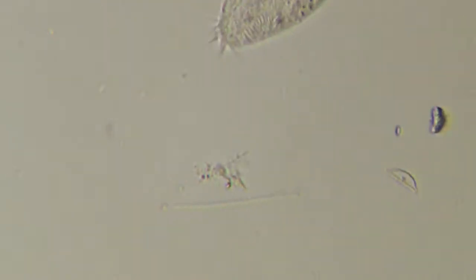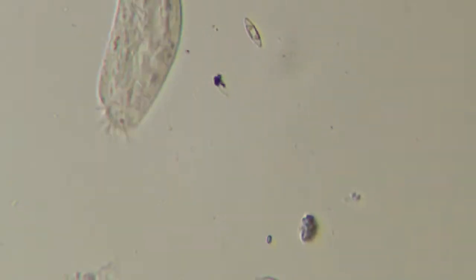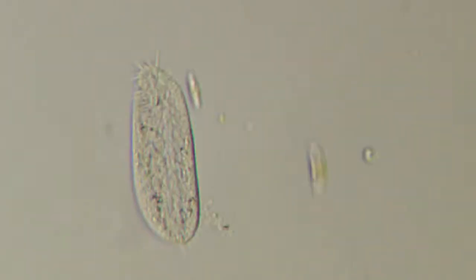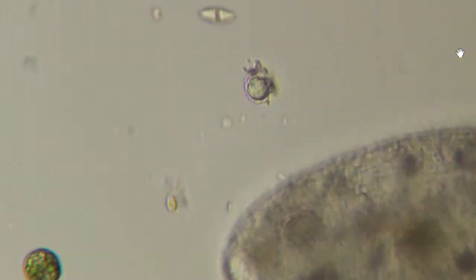XY stage is a little stiff for these fine details. It takes some extra finesse to get a smooth XY motion at a high magnification. And I'm going to zoom out digitally. I think I'm turning too much. And I can kind of follow. Oh, there's that big dude cruising by. Whoa, yeah. I wanted to follow it a little bit, but now I'll follow it now.